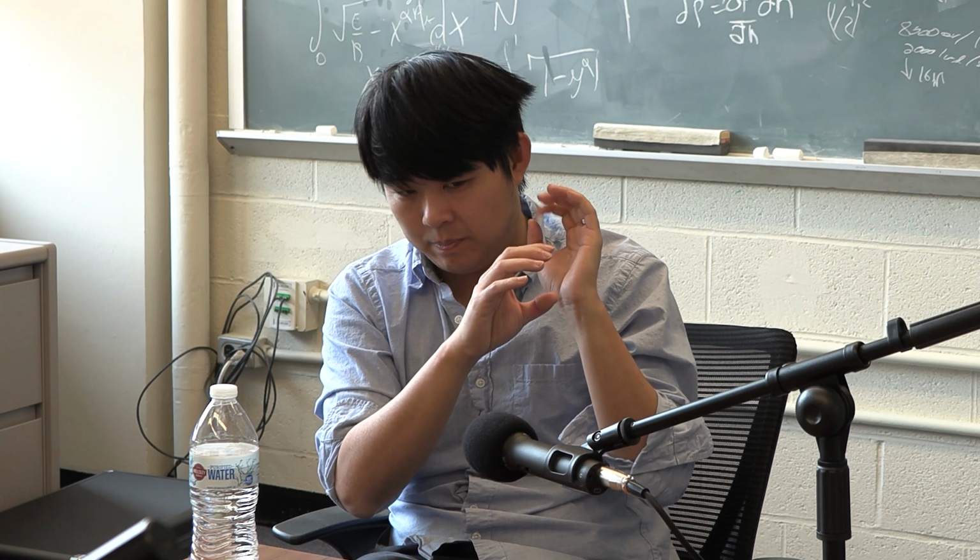Oh, I see. And what we do is we put these beads out onto a surface, and so it basically forms an array of pixels. And on each pixel, we now determine the XY location and also the unique sequence that's associated with that XY location. Quick question. So you have a bead. Is there one barcoded DNA per bead, or are there many? There's about 10 million DNAs per bead.